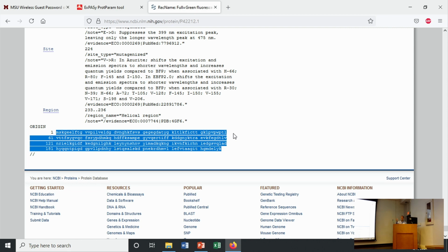I hate to tell you, Kyle, the extinction coefficient is not going to work here because it's fluorescent, right? So it's going to absorb in that region. But if this were a non-fluorescent protein, I could get an estimate of the extinction coefficient as well. The only reason it doesn't work is because he had a very specific example of a protein that strongly absorbs light.